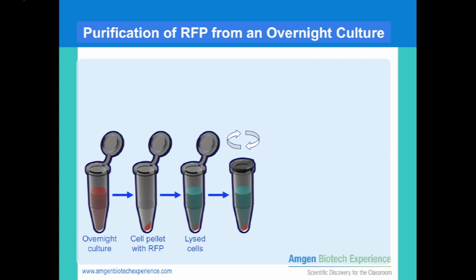Centrifuge again, but notice that the top liquid supernatant is now pink and the pellet at the bottom is white. The pellet contains cell debris. What you want to keep is the pink liquid, which should be a mixture of bacterial proteins and RFP.